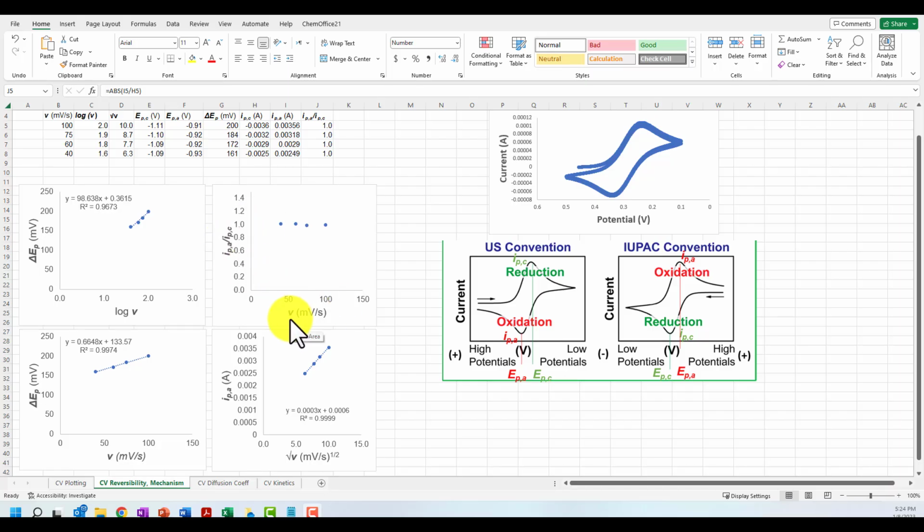in principle, if this is a nice reversible process, or even quasi-reversible process, where the process is purely electrochemical, meaning that there's no subsequent chemical reaction that's stealing one of the species once it gets oxidized or reduced, then we'd expect these two peaks to be the same size, which is what a ratio of 1 tells us. But if this starts to deviate away from 1, what we would typically see is that at really slow scan rates, so the limit of slowness down here, we would expect this to be for a system that has a subsequent chemical reaction.